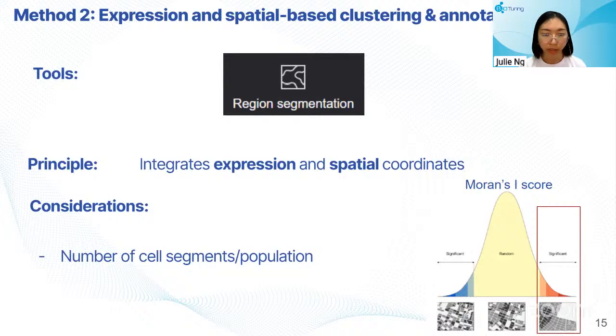Whereas region segmentation not only clusters cells based on their expression, I'm sorry, not cells, genes. They will cluster genes based on their expression profile, and not only on the gene expression matrix, but also on the spatial coordinates as well.